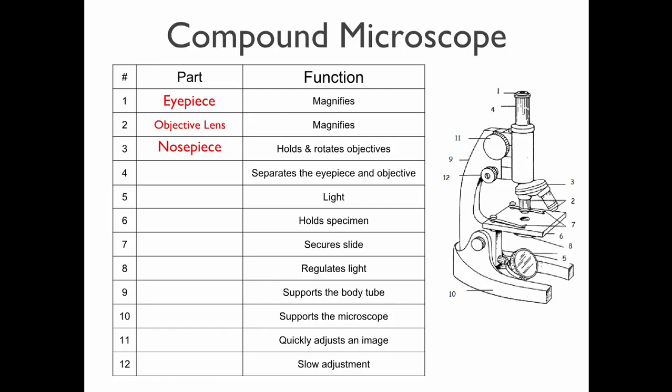So sometimes, all right, listen. Sometimes you can go to Walmart and Target, and they do sell microscopes. They're typically made of plastic. The lenses are not good quality. Sometimes those kind of microscopes, you might be able to see something under low power, but not really under high power. Sometimes they'll say it magnifies 1,000 times. They will never do that.